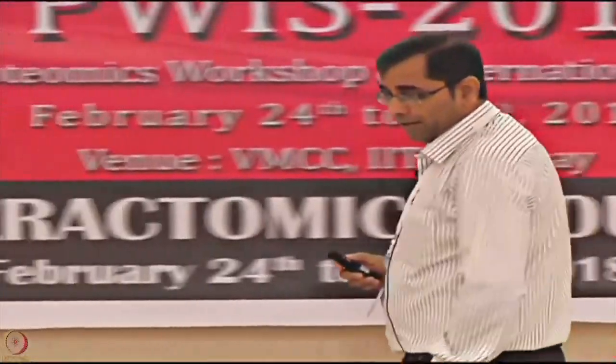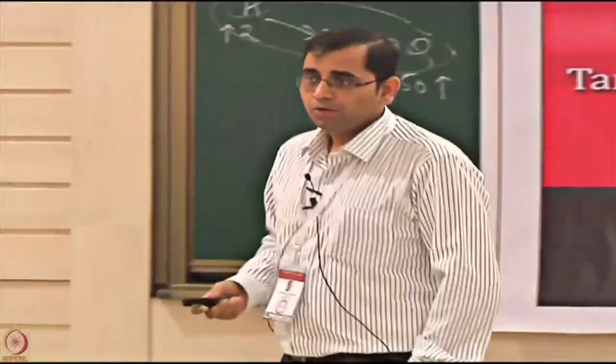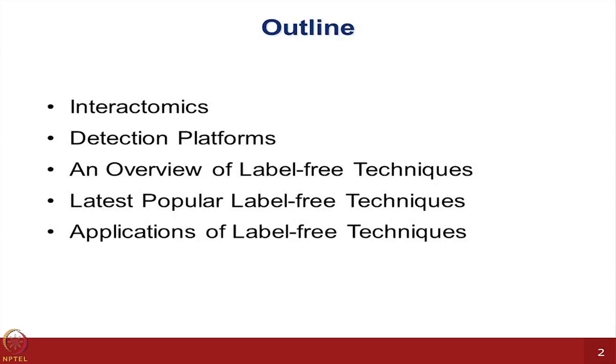Let me start with the outline of what I am going to talk about. A couple of things which you have been hearing already, the field of interactomics, I will not take much time on that. But then I will move to comparing the detection platforms, because you are hearing a lot of lectures from Josh on protein microarrays. You have heard many other speakers on reverse phase arrays and peptide arrays. All of those require some level of label-based detection system, and yesterday you also started getting exposed to some of the label-free platforms.